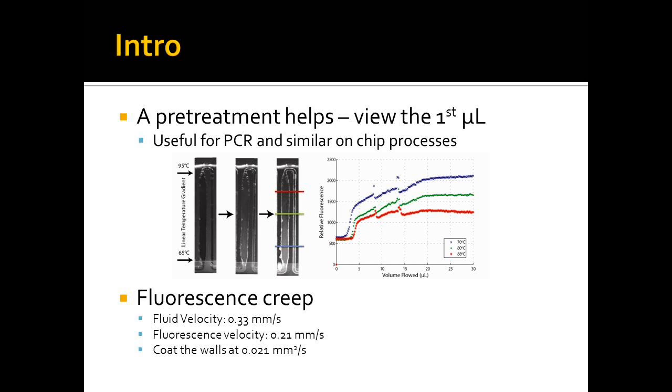We've been able to calculate a difference between the fluid velocity and this fluorescence velocity, and given your particular geometry, we were able to calculate a rate at which the coating is sticking to the walls and attaching into our system.